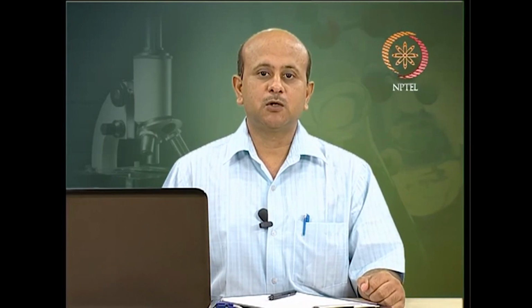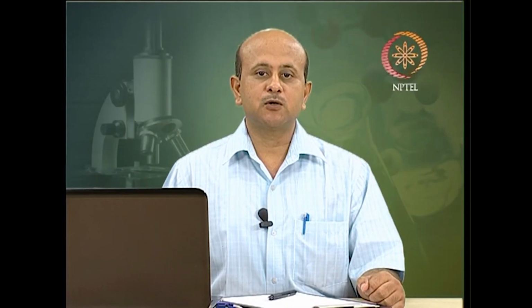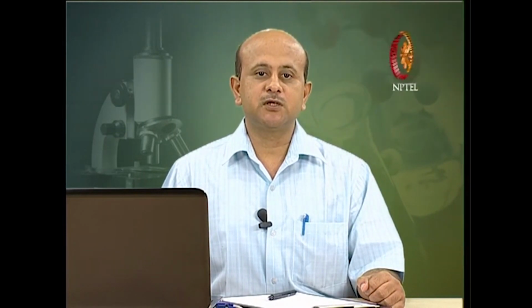In this lecture, we are going to discuss another important spectroscopic technique, and that is circular dichroism. Circular dichroism, or in short CD, refers to the differential absorption of left and right circularly polarized light.